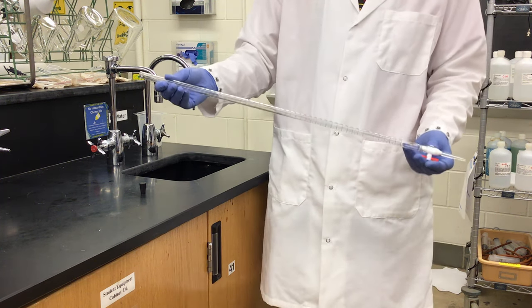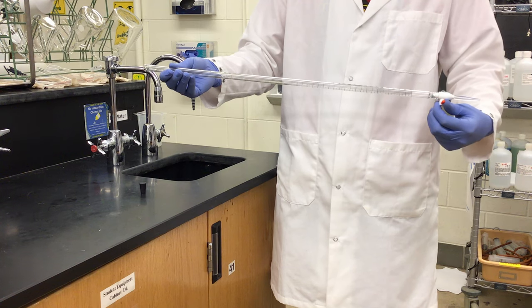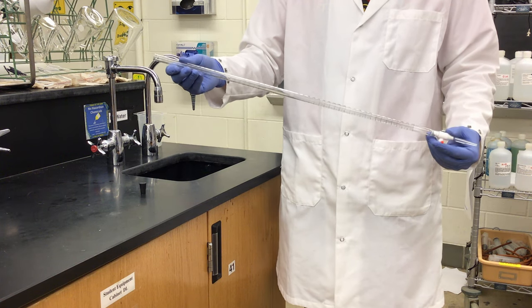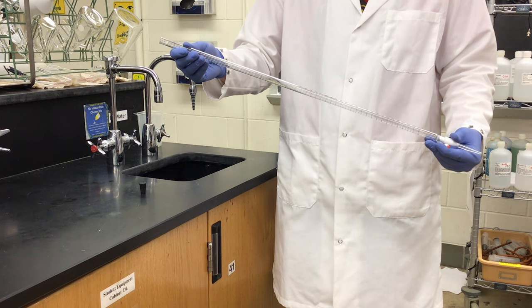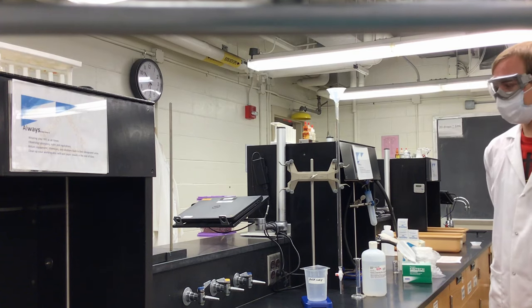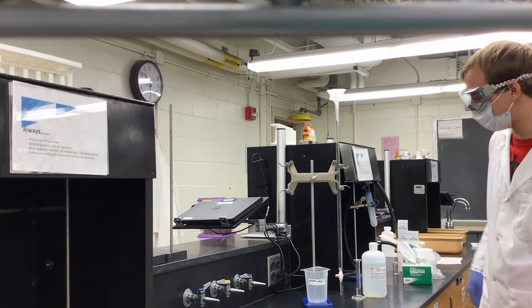Now that we have the empty burette, I will close the stopcock and move to my ring stand with my double burette clamp. Here we have our freshly emptied burette and we now need to rinse it with our titrant.